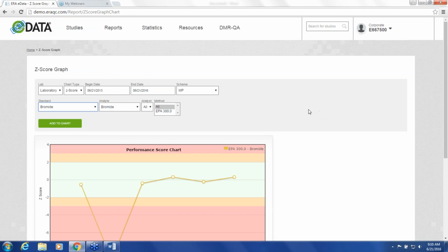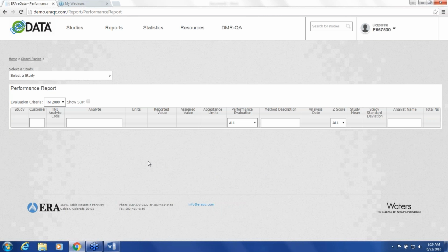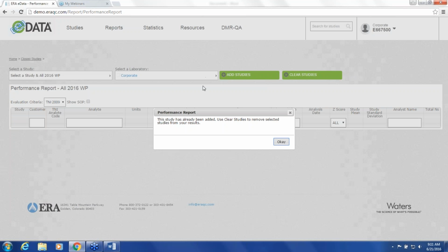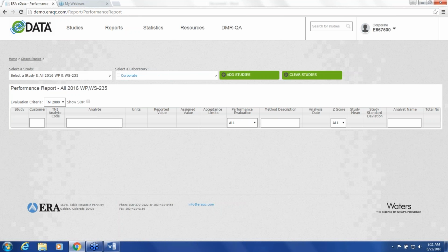Okay. Just like to show you the performance report. With the performance report, you can begin by selecting a study. So we'll look at 2016 results. We'll select WP, and in this case, WP 252. Okay. Well, I'm getting a message that that's already been added. We'll select a different study here. Okay, and select the laboratory.